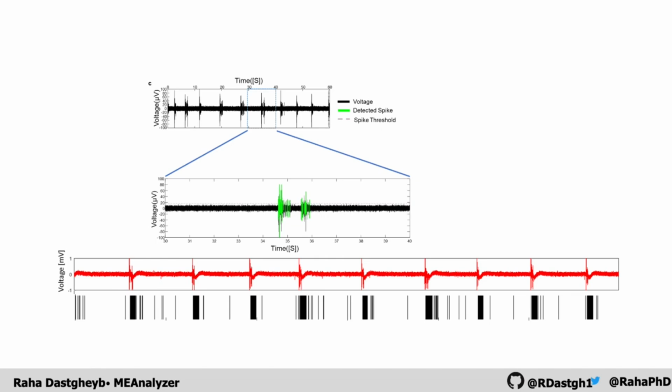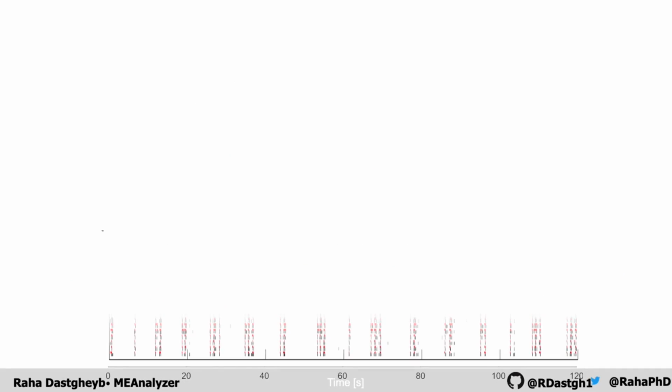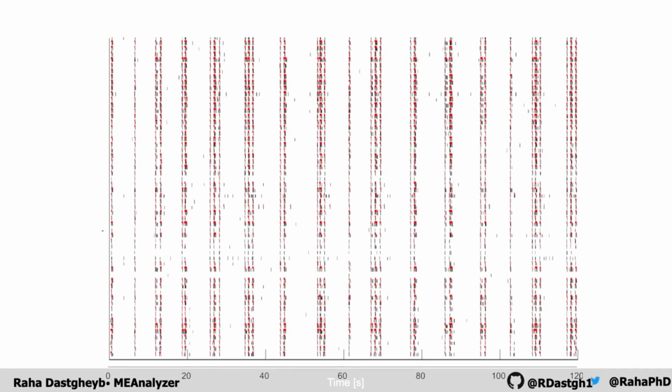And the first thing that we're going to do is identify bursts, which are clusters of spikes. We define them, we control how they're calculated, and we can visualize them as given by the red line on top. So this is just one electrode. If we stack them on top of each other, we get a raster plot. This raster plot gives us a way of visualizing electrode activity over time over all electrodes. We can make some observations from it, but it's still not very easy to read.